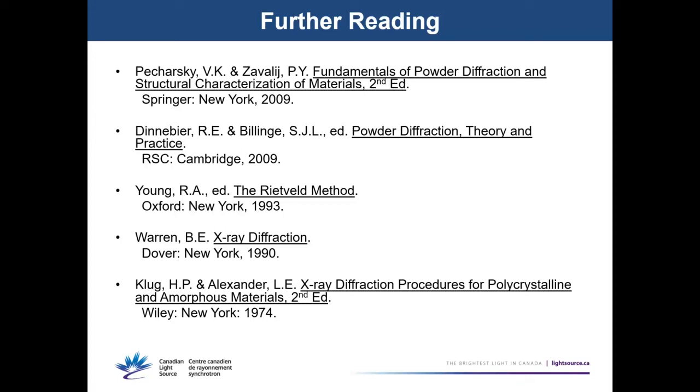Spinning the sample, rotating it in a plane or whatever it is one does on the Bragg-Brentano machine, integrating around the rings in a 2D image. What those things do is make the texture cylindrical, which makes it easier to model. It does not eliminate it, it makes it cylindrical. So you have to be a little careful about that. It's hard to make the cylindrical orientation go away. You can't do it with those methods. It simply simplifies it, makes it more amenable to treatment by the model. So the best thing to do is to try to prepare the samples carefully. It can be really hard.